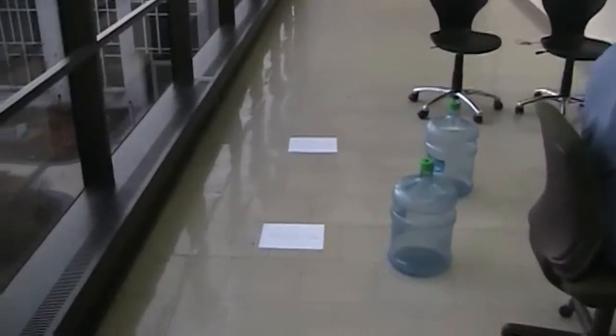By checking our molecular markers, we see they are stuck around 300 pounds. Brent and Jacob didn't go very far because they are too bulky to pass through the gel. This trial gives us the mass of the entire protein. Therefore, Jacob and Brent's mass is 300 pounds.